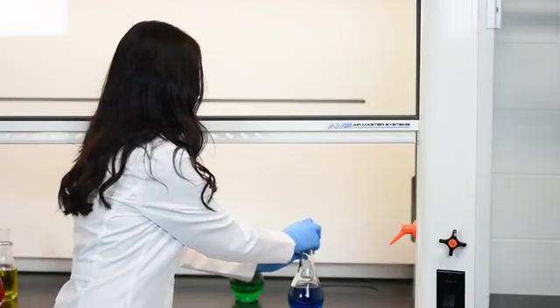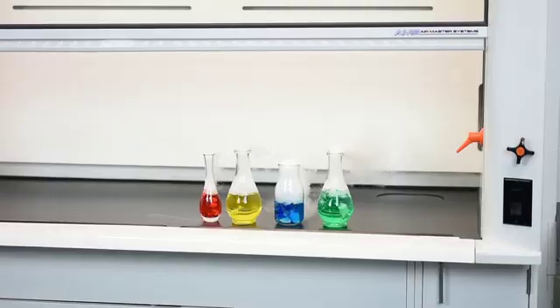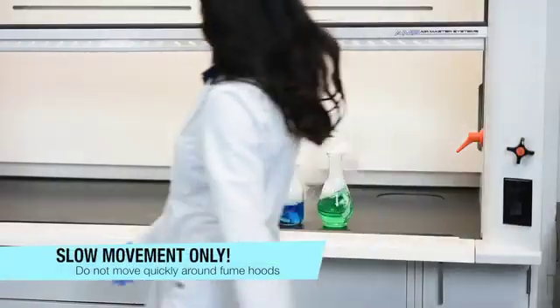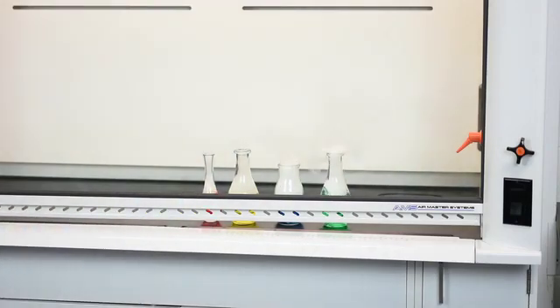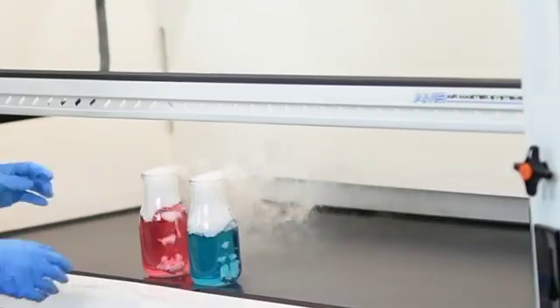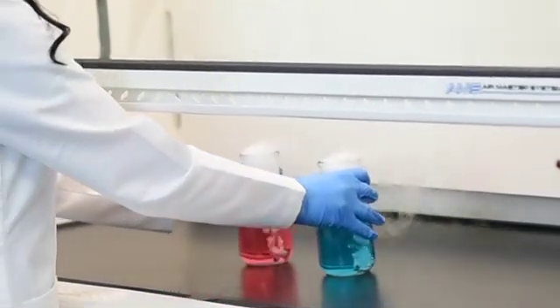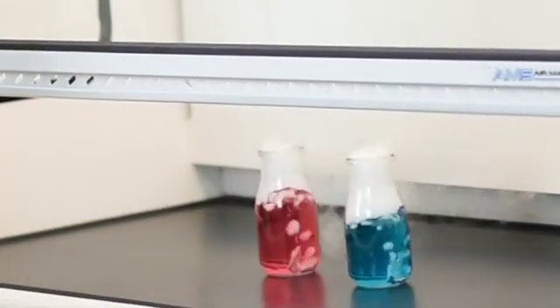It is also important to keep the caps on all chemicals that are not in use. Quick movements in a laboratory can disrupt air flow. It is very important to walk slowly through a laboratory and also to work in direct movements. Reaching straight in and straight out of the hood is the best recommendation.